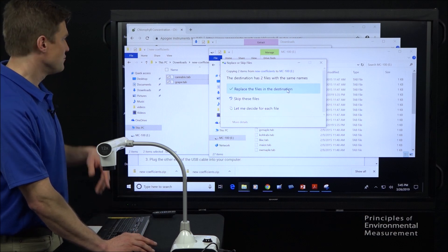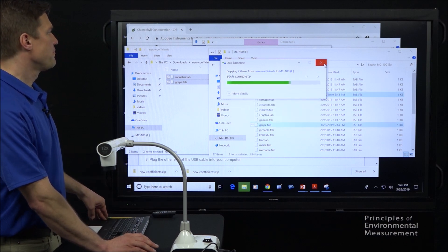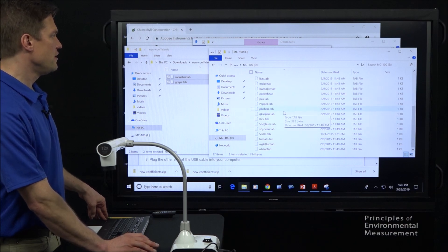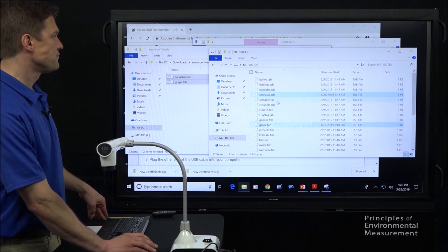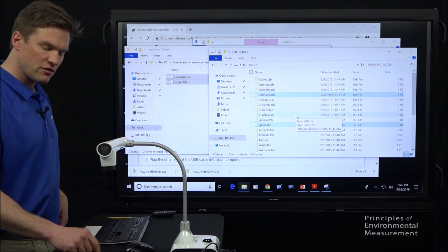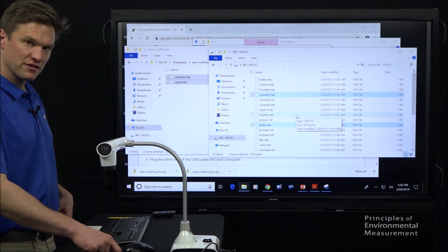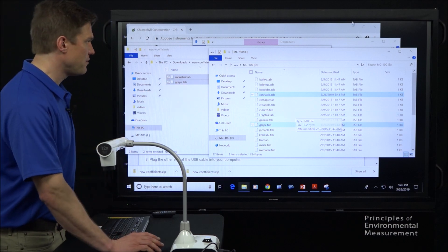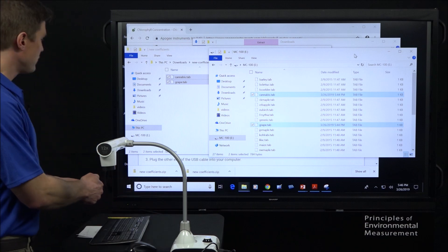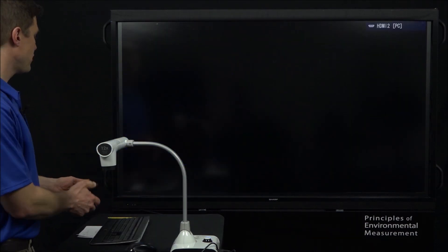Oh, I already had them in there, but we'll replace them. So now we have cannabis and we have grape in the meter. When you do this, they may show up down at the bottom. So you have to scroll all the way to the bottom of the list when we get to this step. But for the time being, they're in there. And so now I'm going to switch back over to our MC100 display.